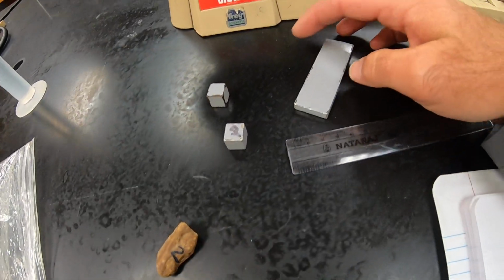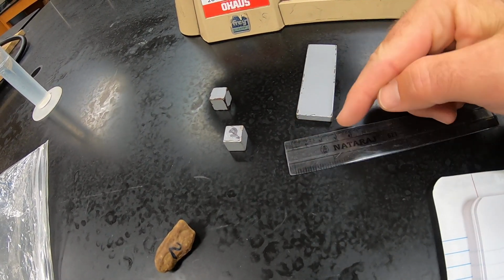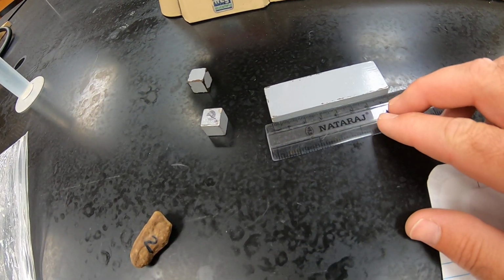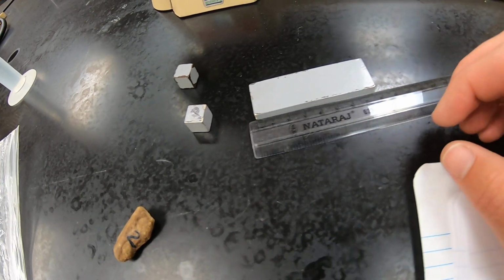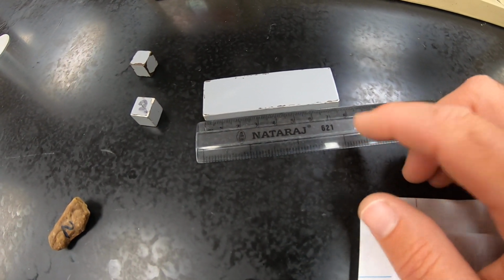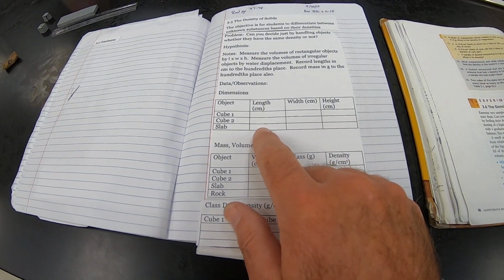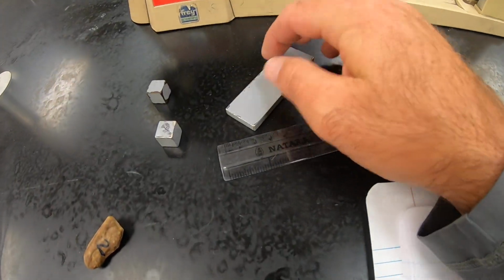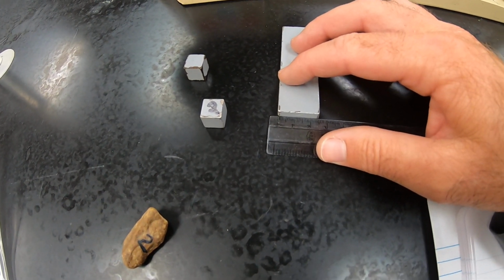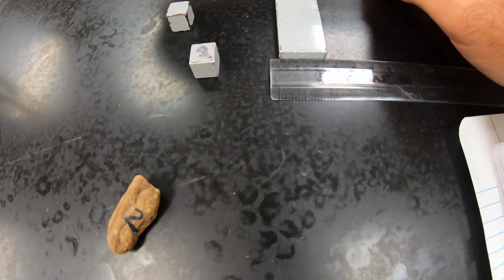So we'll do the same thing with the slab. We'll just pick a corner, this one here. This is the length, this is the width, and this is the height. We'll do the length first. That's pretty close. It's almost 7.8. Let's call it 7.78 for the length. And then the width is almost 2.5.